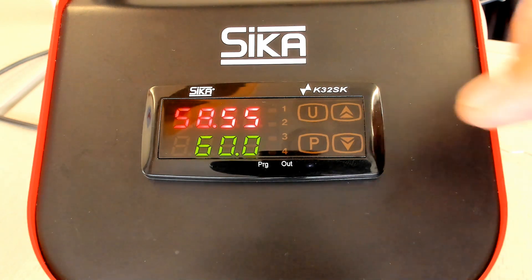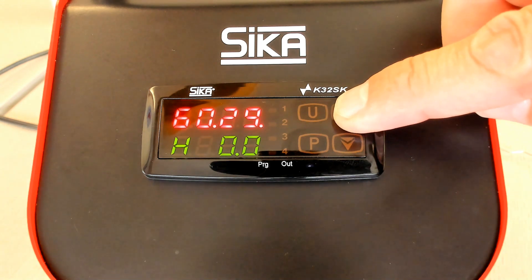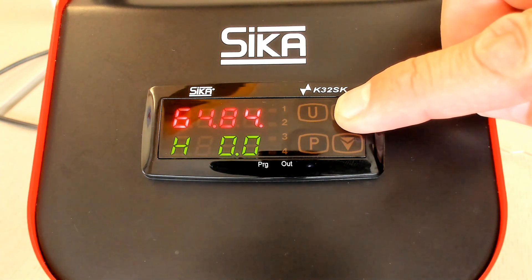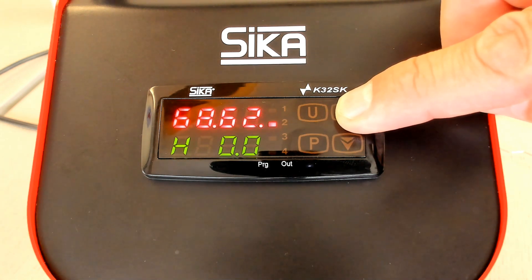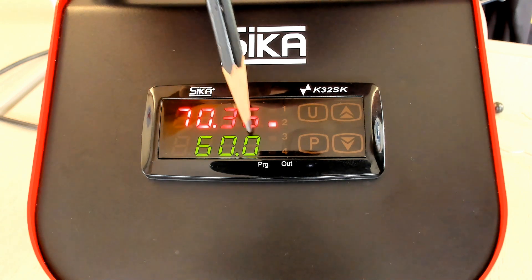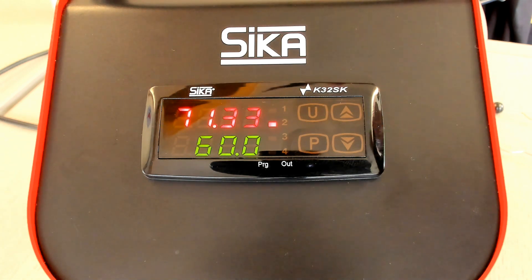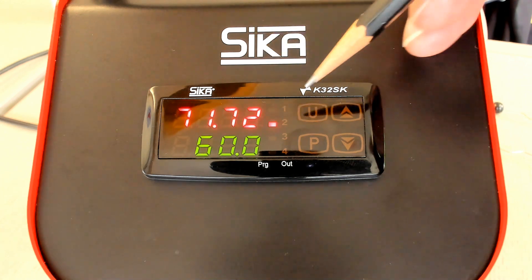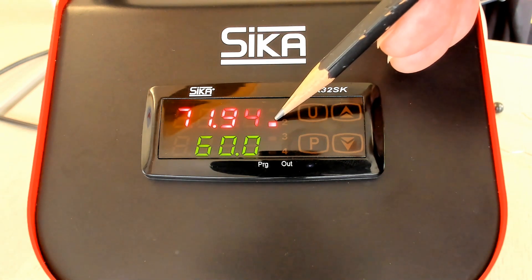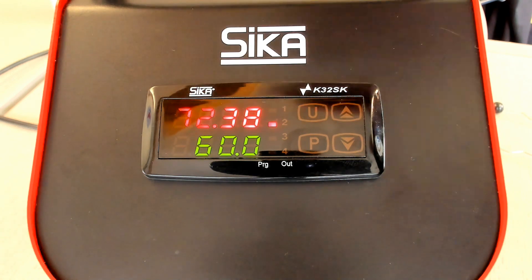Another functionality: if you push the up key during the standard indication, then you can see H00. This value gives an indication of the current output power. Here we see 00, that means 0% output power, because the set point is 60 and the current block temperature is 70 — so the power is switched off and the calibrator cools down. The cooling down is indicated by the second LED, and the calibrator cools automatically until we reach 60 centigrade.